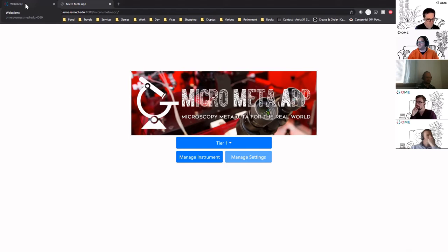Once you have done your acquisition, you should be able to import the microscope that you used, import the images you used, and then enter the information that is missing from the image. In a perfect world, all this information should come from your image already, so you shouldn't really be required to add anything. But as we well know, that's not the case right now. Hopefully it's going to be the case in the future, but for the moment there is a lot of information in the acquisition still missing. So that step should be done, in an optimistic case, every time you get an acquisition.